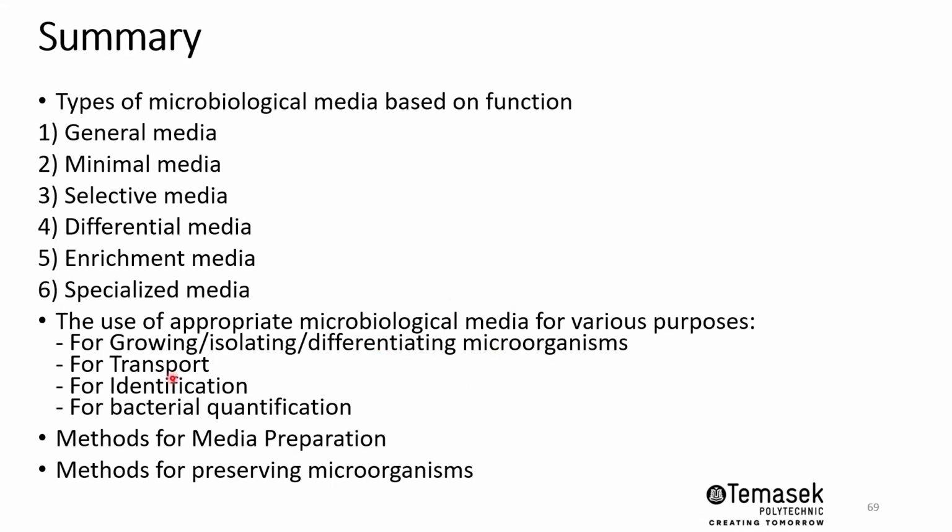Microbial media are often used for growing, isolating, and differentiating the different microbes, and we looked at how they are used in different scenarios. Finally, we talked about the different methods for media preparation. Culture media are typically prepared under aseptic techniques, and if you have certain constituents that are non-sterile, you need to make sure that they are filter sterilized first to render them sterile before adding them to the sterile media, because we want to culture just the intended microbes here.